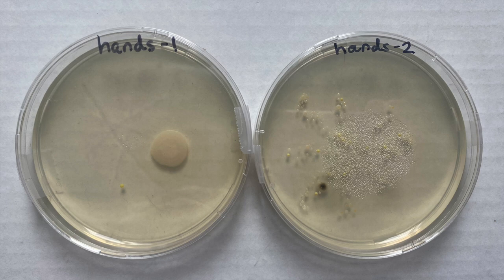In our last image, we're looking at a comparison of the hands one and hands two plates. We swabbed my son's hands, he went and washed them, and then we swabbed again after washing — that's the hands two plate. There are still some colonies visible. My hypothesis is that after washing, my son blew his hands dry from his mouth. Since the mouth contains a lot of bacteria, blowing his hands dry may have reintroduced some bacteria back onto his hands.